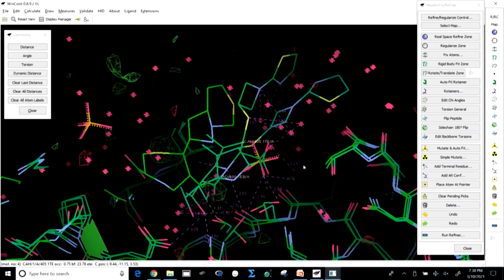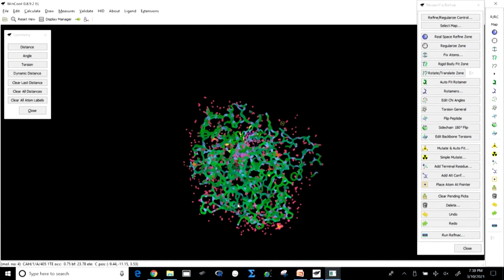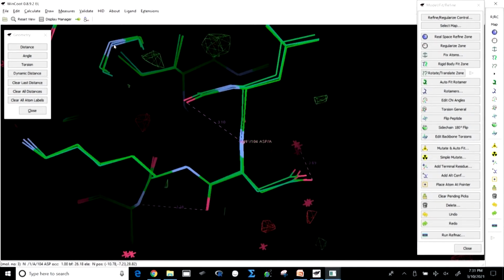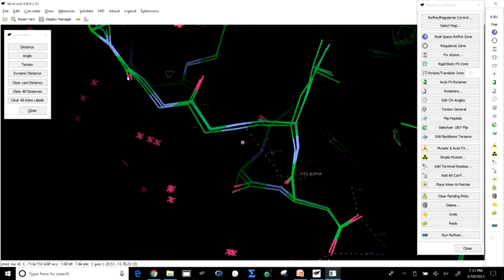So, those changes, those movements are really critical, which were not apparently observed in normal biochemical analysis, but when you are comparing all those structures, you get the movements of those small molecules, as well as the movement in the amino acids.